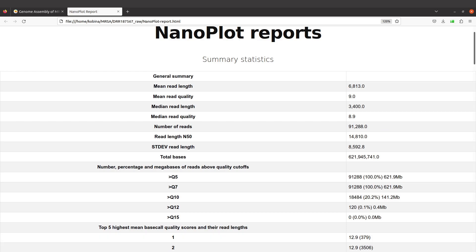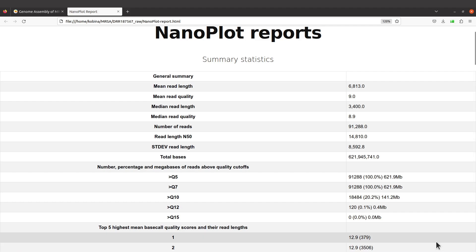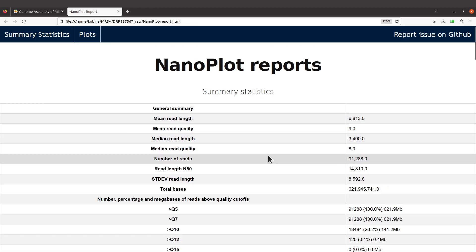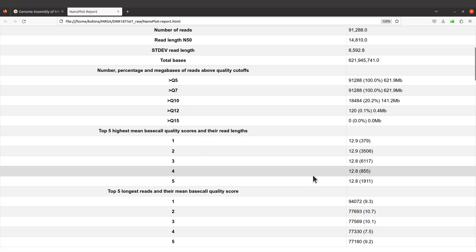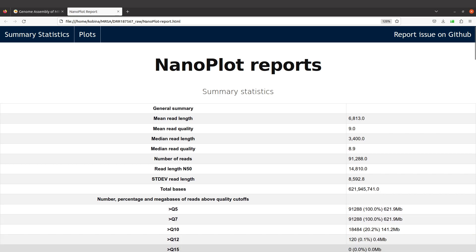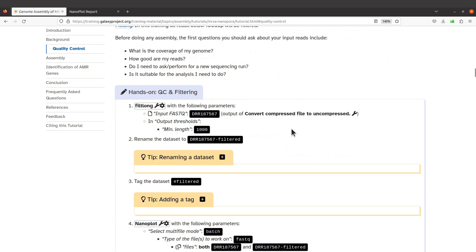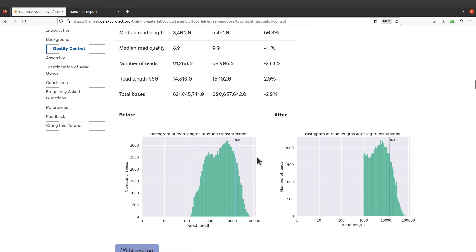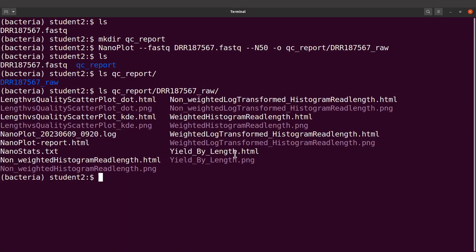What we are going to do next is filter the reads, and then we should see some improvements. After filtering we are going to perform QC again and compare the metrics — the raw reads versus the filtered reads. The Galaxy tutorial also did it this way. We are going to do the command line version and compare to see if we have a similar observation. Let's go back to the terminal and clear the screen.